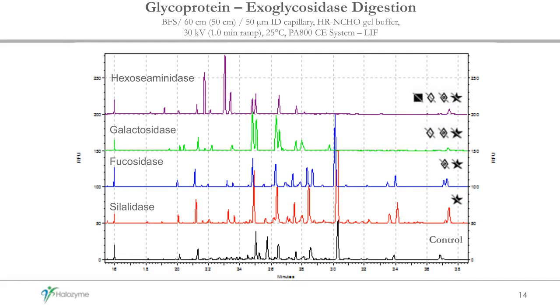Okay, so here I wanted to share some of the work that we're currently doing. As you can see, we've measured our identification of our glycans by mass spec using the RapidFluor, and even with the 2AA, we've done mass spec to get identification.